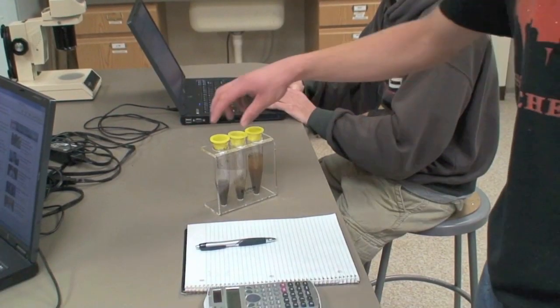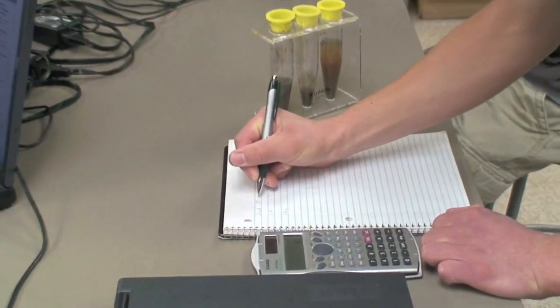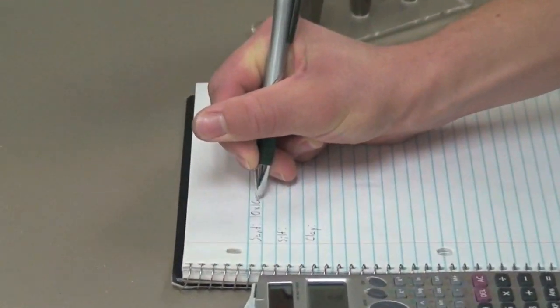To calculate the sand percentage of the soil, look at the sand level in the first tube. Multiply the reading by 100 and divide by 15.